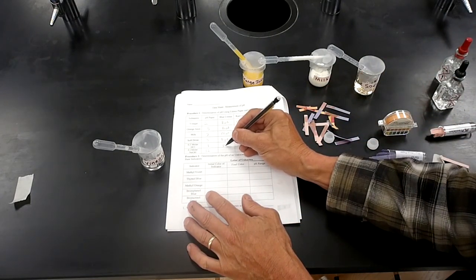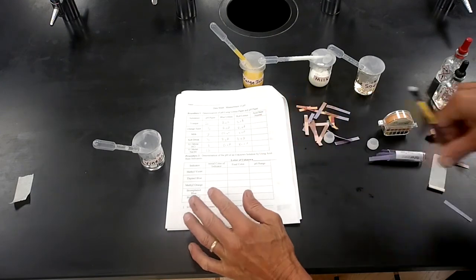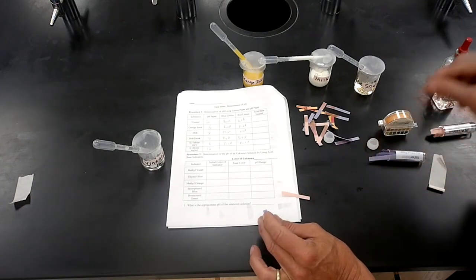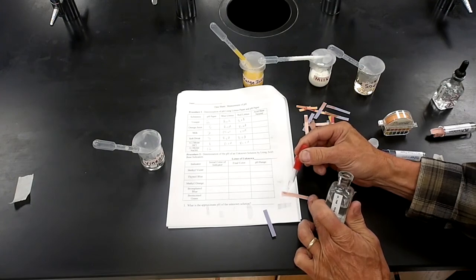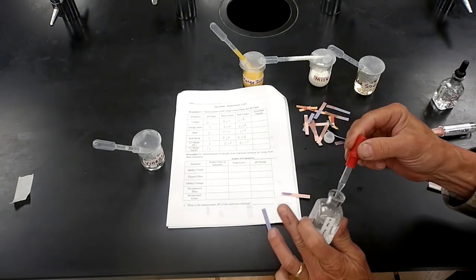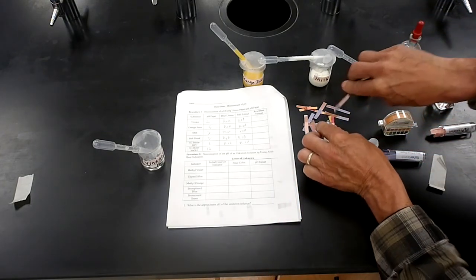So the blue turned red, the red stayed red, and last one. We'll look at the 0.1 molar sodium hydroxide. Ooh, red turned blue, blue stayed blue, which is what you'd expect. So blue and blue for sure.